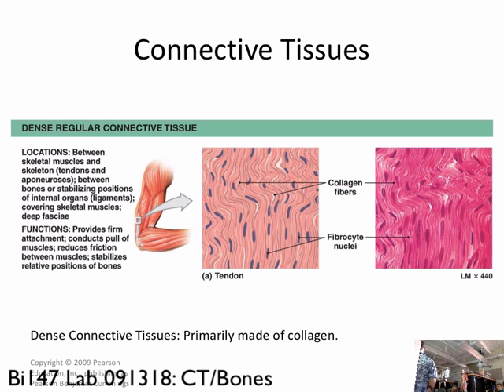So these fibers that you see all parallel and lined up, those are collagen fibers. Now, what did I say about collagen? Strong, strong along the length. It's basically a giant protein rope. So there's this long tapestry of collagen fibers that run along the length that the tendon or ligament is going to experience force.